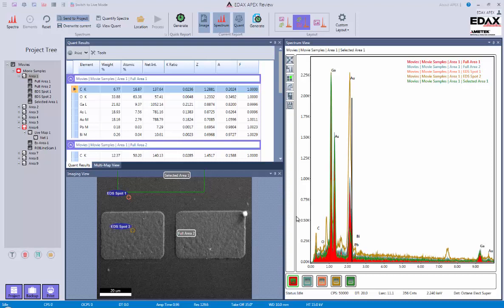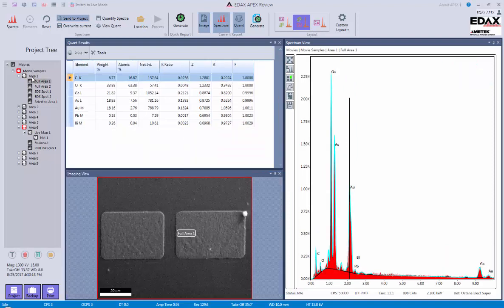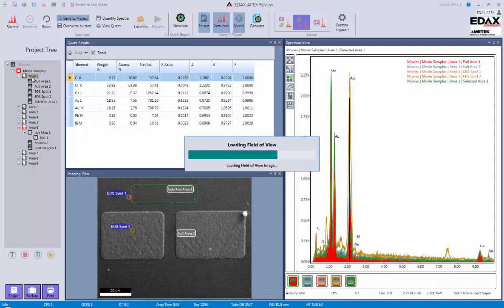So the basics of reporting is I need to be in review mode, and then I do need to have something selected. In this case here, I can either select things like a single spectrum, or in this case I'm actually going to click on the area and load the entire area.